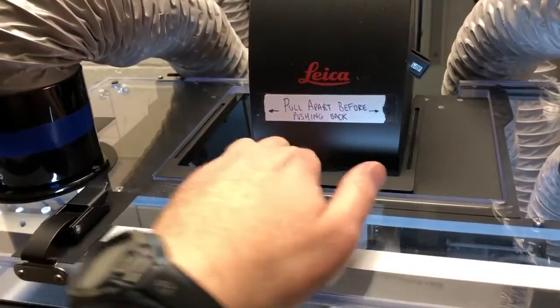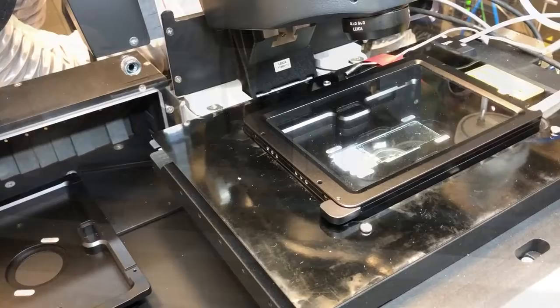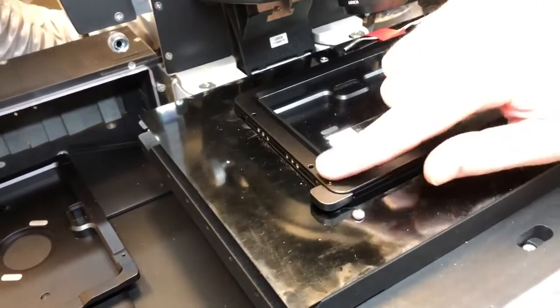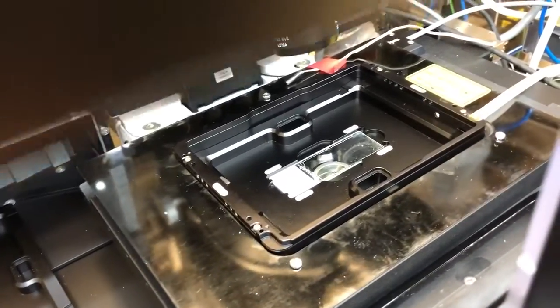We need to open these two panels and push this back so we have a little bit more room. Then we are going to remove this lid — there's a tab that can help you here to remove this lid.